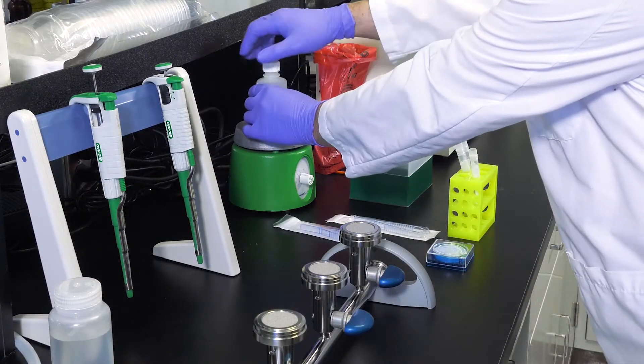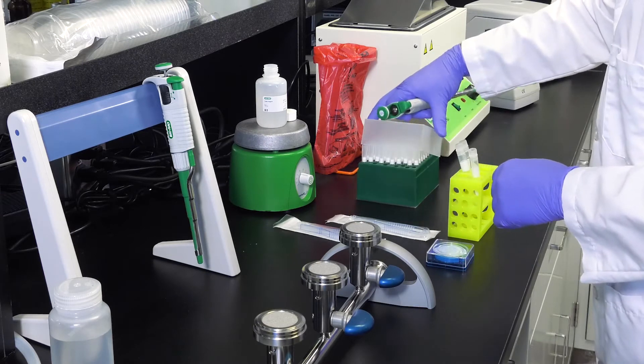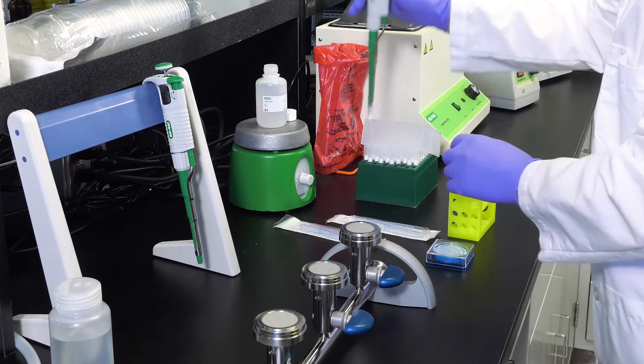First, pipette two milliliters of R1 solution into a cryotube. The R1 reagent must be continuously stirring on a magnetic stir plate.